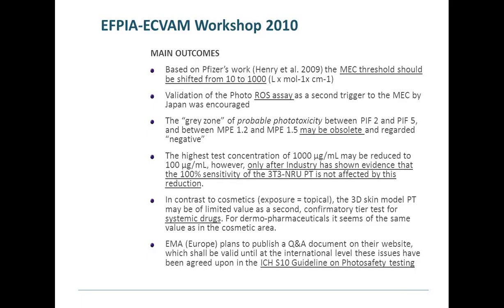But with a systemic application in the media, it is, let's say, a bit poor modeling of what happens systemically if a drug is entering the skin via the systemic route.